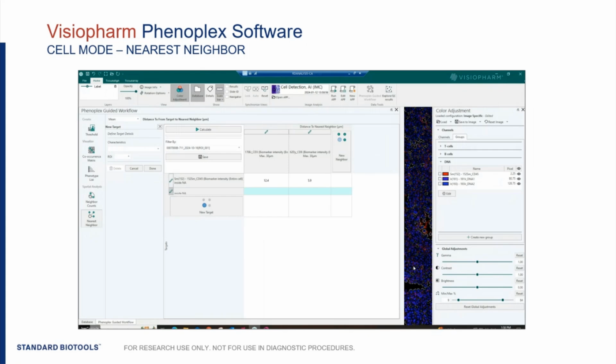and for example, the proximity of certain immune cell types can really help inform you of the immune response that may be occurring within the tissue sample. Again, it comes down to what your biological question is. Utilizing both neighbor counts and nearest neighbor tools is essential to answering a lot of your spatial biology questions.